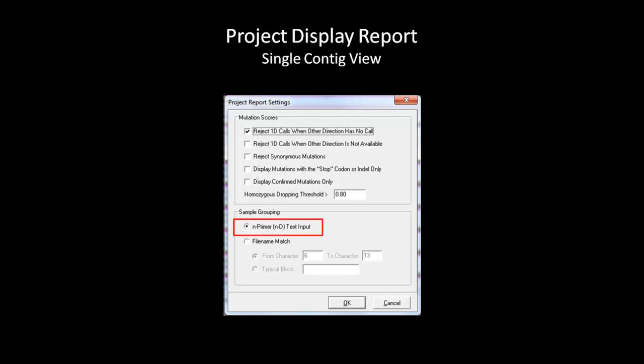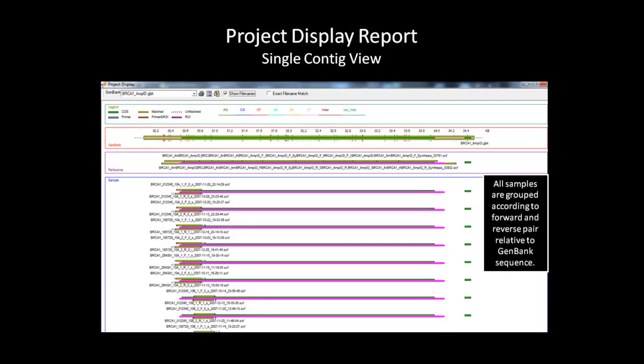The second grouping option is to group all samples by text input. If you loaded a grouping file in the open files dialog box, this option will group all sample files accordingly. If you did not load a grouping file, this option will group the samples by their respective forward and reverse pair. With this option selected, the report will look like this. You can observe in this window that each pair of forward and reverse samples are aligned to their respective positions. In this view, you can see where each sample file overlaps each other. You can print the report by using the print icon.